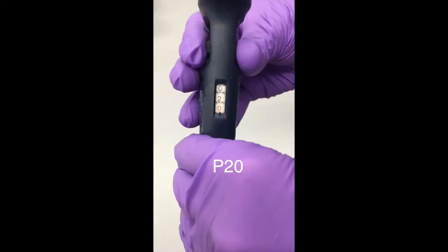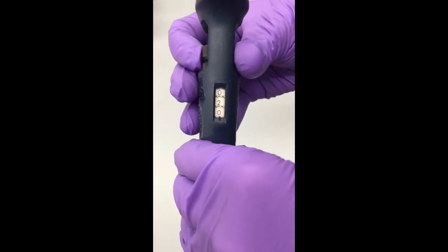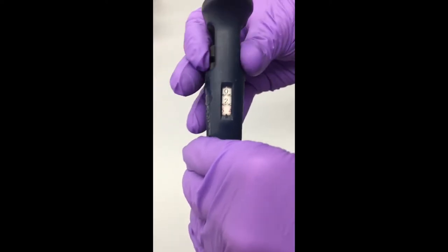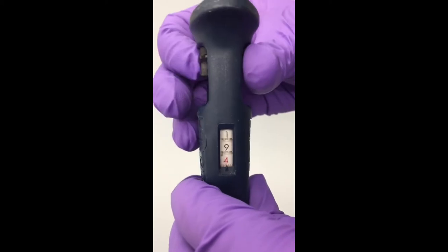This is the volume display and indicates how much fluid will be drawn up. For the P20, the red number indicates a decimal point, so this number reads 2.0. As you can see, turning the volume adjustment changes the reading on the volume display.